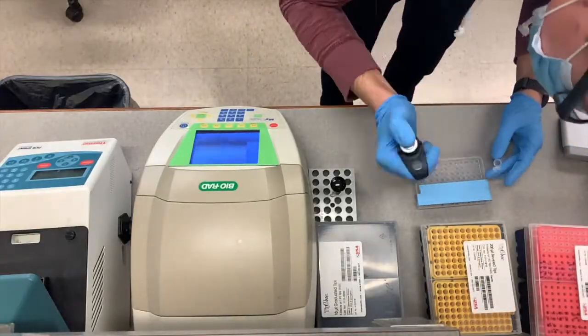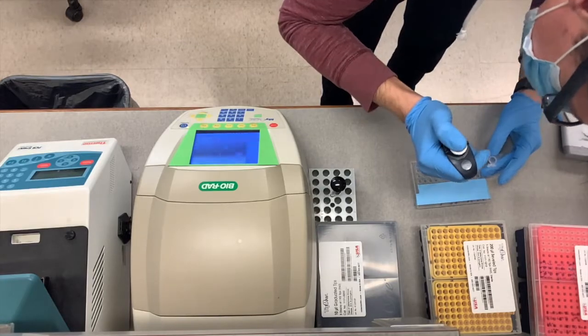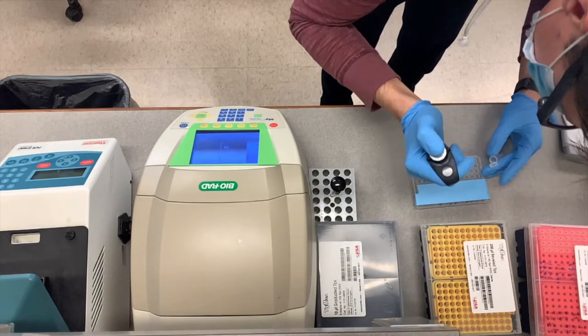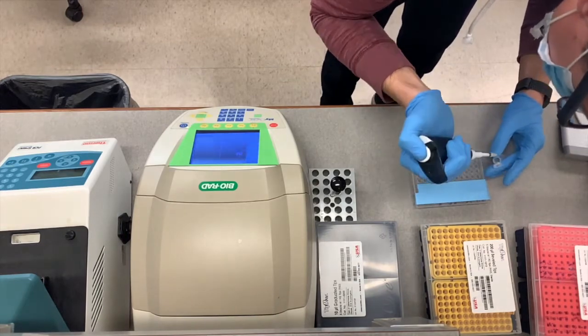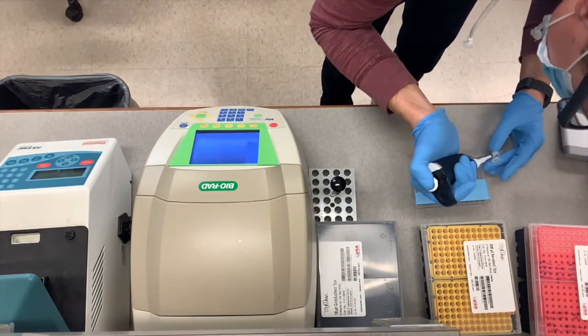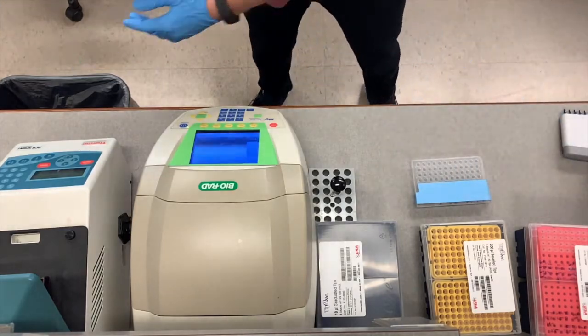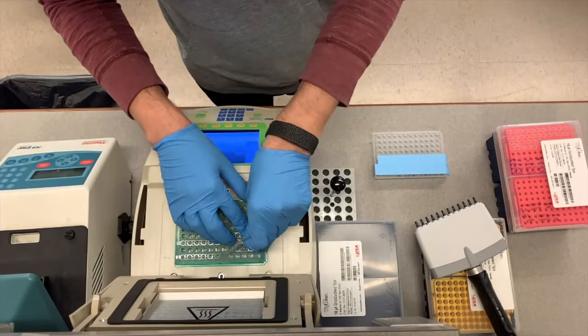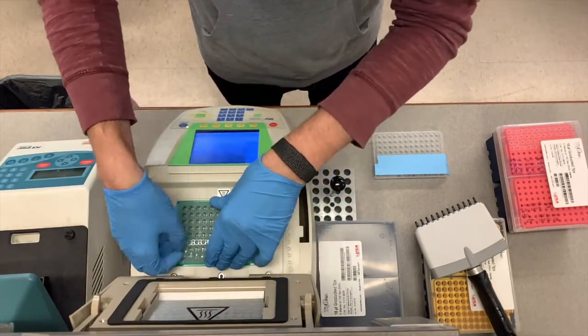So once the reaction's gone for the amount of time that you want it to go for, here was about an hour, we're going to add the quench buffer. So what I'm doing here is distributing out 10 microliters of quench buffer into each of these wells so that I can use a multi-channel pipette and pipette 5 microliters into all of the reaction samples.